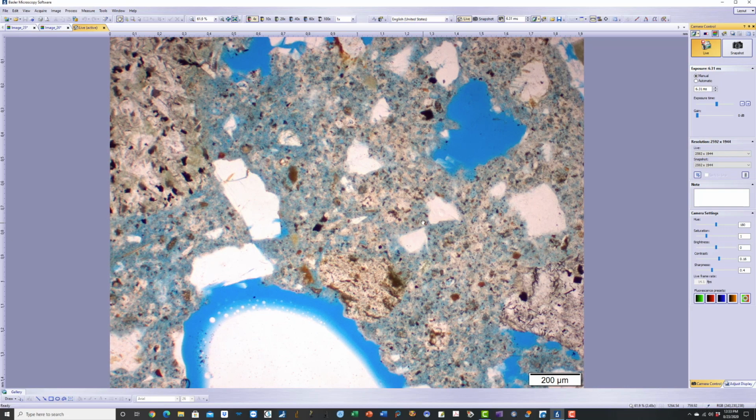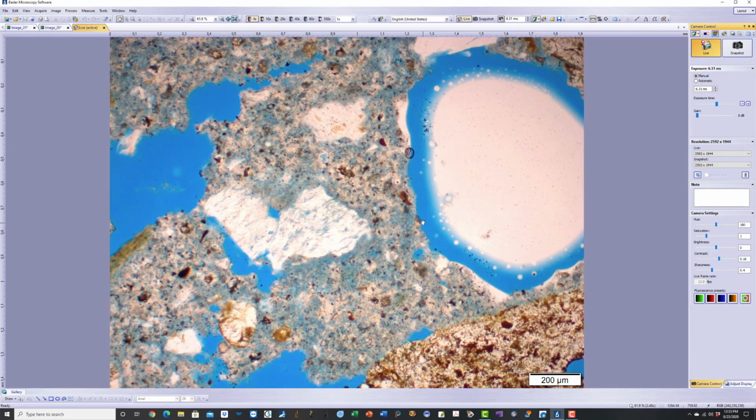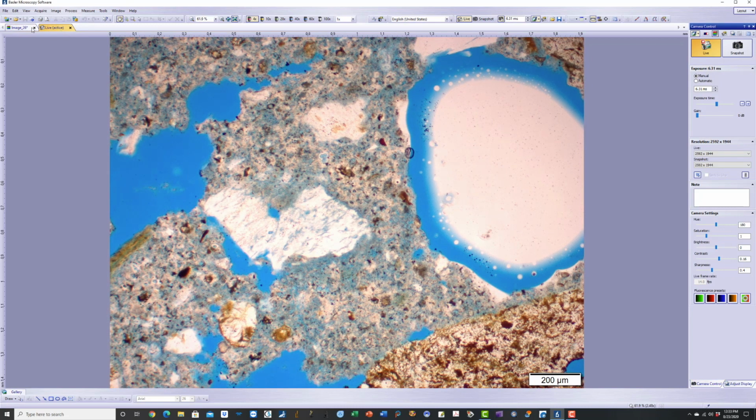Anything interesting, then I continue capturing images with this snapshot mode. And usually I'll show you when you capture those images, don't save any. If I remove all the images, see how easy it is. I'm in the live mode. If I want to capture this, I just go to snapshot and immediately capture one image.